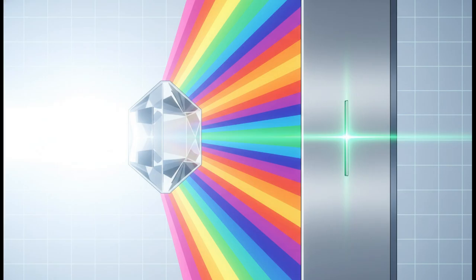Okay, so once we have all that light, we immediately face a problem. We absolutely cannot use it all at once. If we blasted our sample with the entire spectrum, our data would just be a chaotic mess. So the monochromator steps in to act as a highly specific filter. It takes that broad beam of light, disperses it out into its individual wavelengths, and then uses a super narrow exit slit to isolate just the exact wavelength, the exact color or UV frequency that we need to interact with the specific chemical we're analyzing.